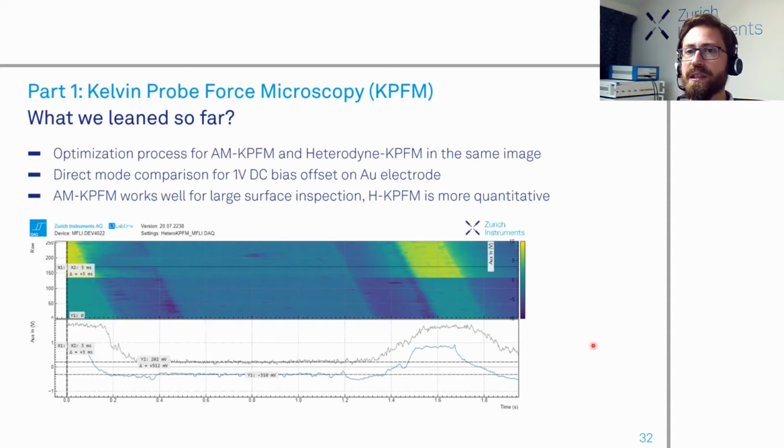So let's look at the other side of the mirror in the time domain. And for this, we need a faster instrument with better control of delays and with higher sampling resolution, so that we can start looking at some time-dependent phenomena. So Mehdi is definitely the expert on this, so I'm very happy to let him continue the show. So Mehdi, when you're ready.